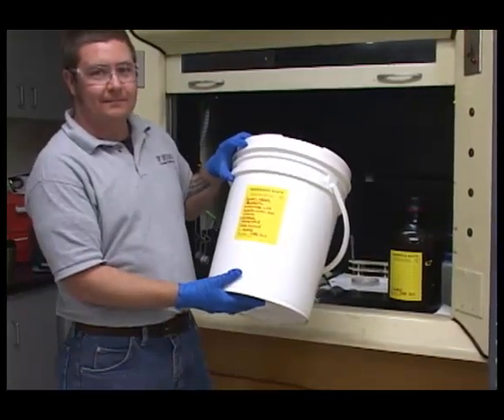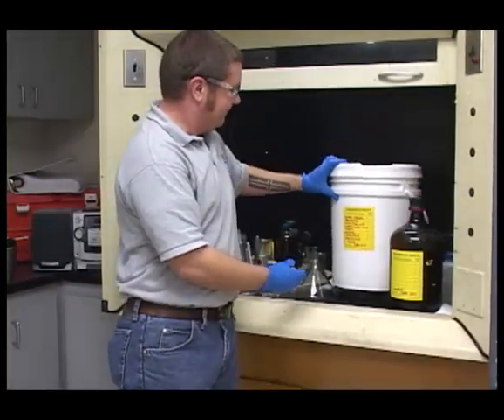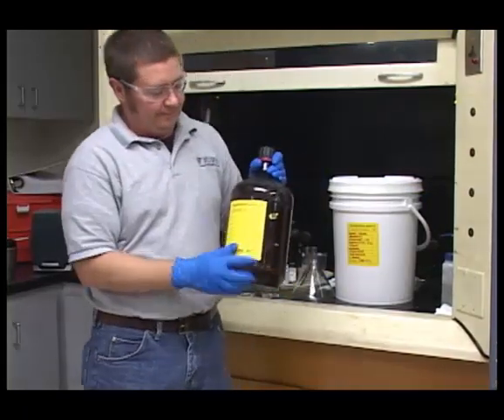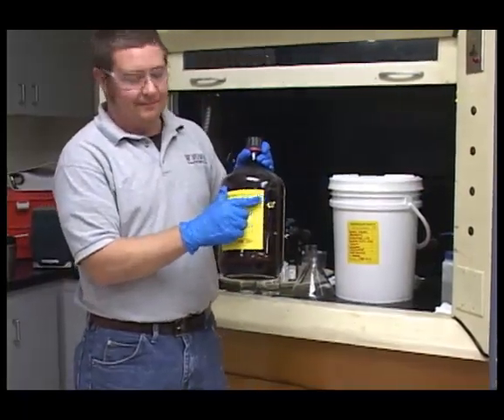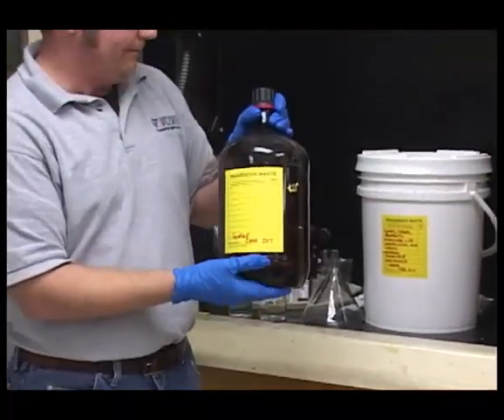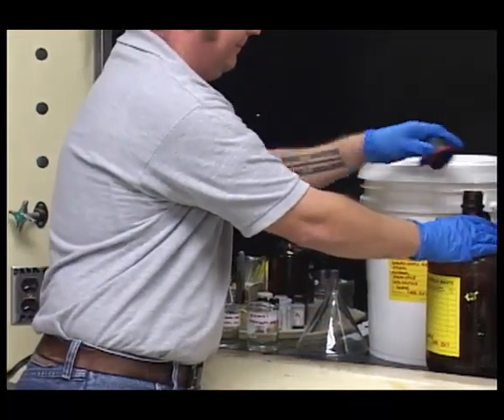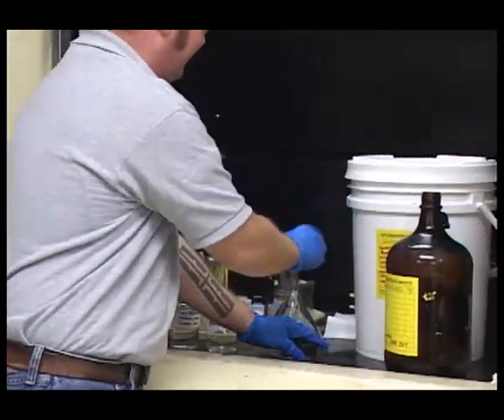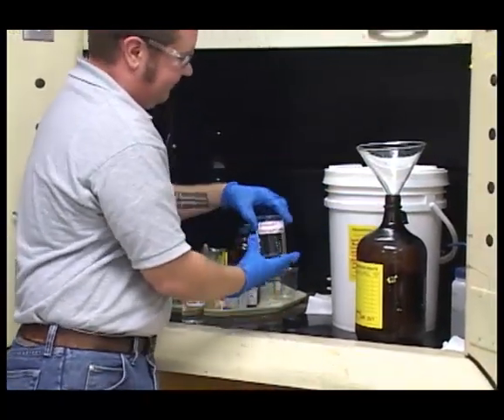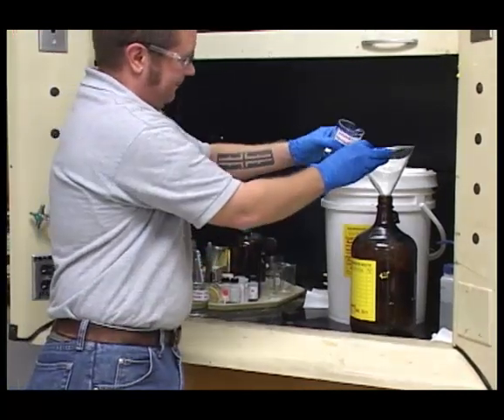If you do this one simple thing, you immediately meet the most basic requirement for hazardous waste which the EPA has, which simply states that every single container of hazardous waste must be conspicuously marked with the specific words hazardous waste. The other thing that this action accomplishes is that you now have this nice convenient area for people to simply update the list of constituents whenever they make an addition to the container.